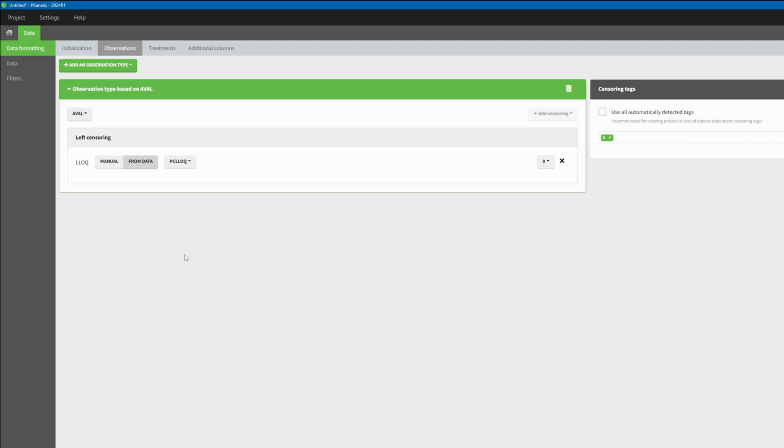If instead I would have typed the value of the LOQ, I may still save the observation in the presets, but I need to remember that I may want to adjust the LOQ value after the preset has been applied, if the LOQ is different for the new dataset.